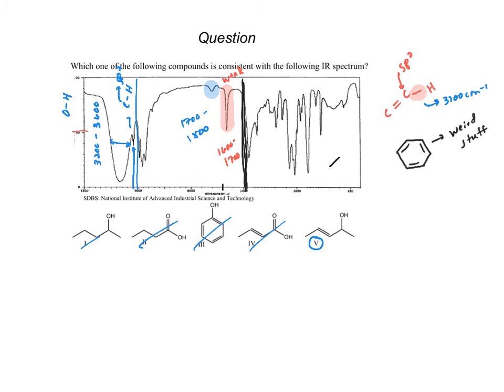I want to say CC. That'd be carbon-carbon. No. Carbon-oxygen double bonds will come in at about 1680 to 1750, about that region. Where's this carbon-oxygen double bond coming from in this molecule? It's very tiny, only a small proportion of it. But for this molecule, where's it coming from? Is there a resonance structure that I could draw for this? Yes. So this is a good indicator that we do have a resonance structure.